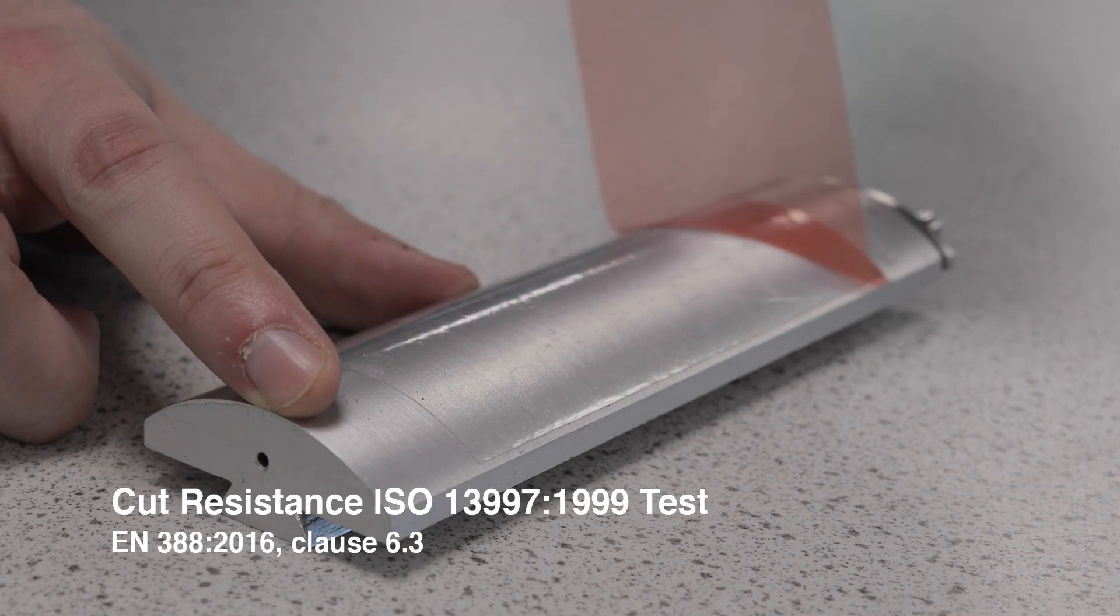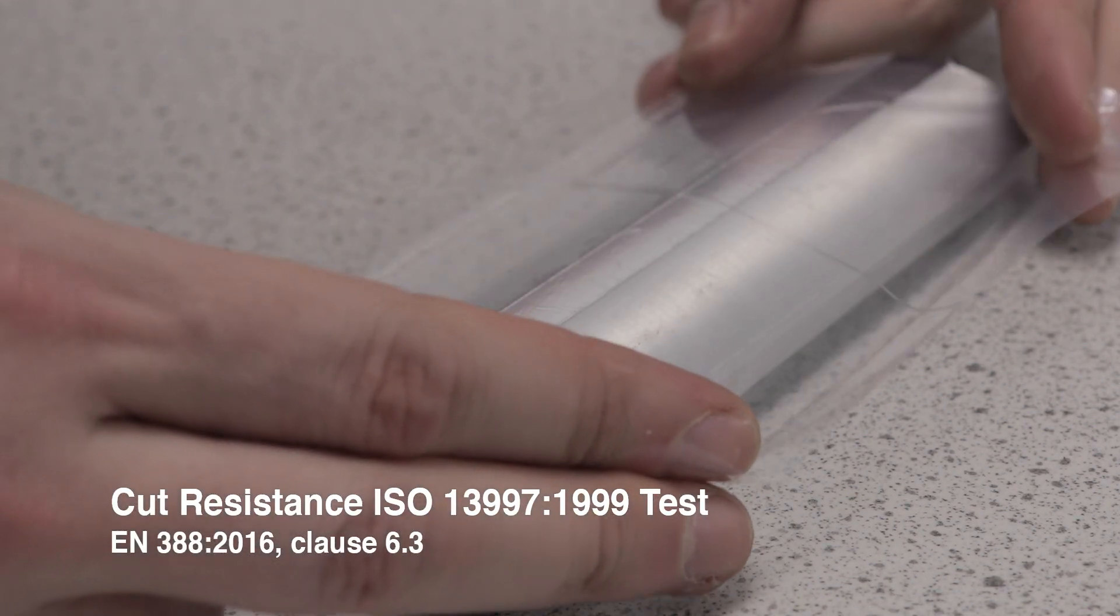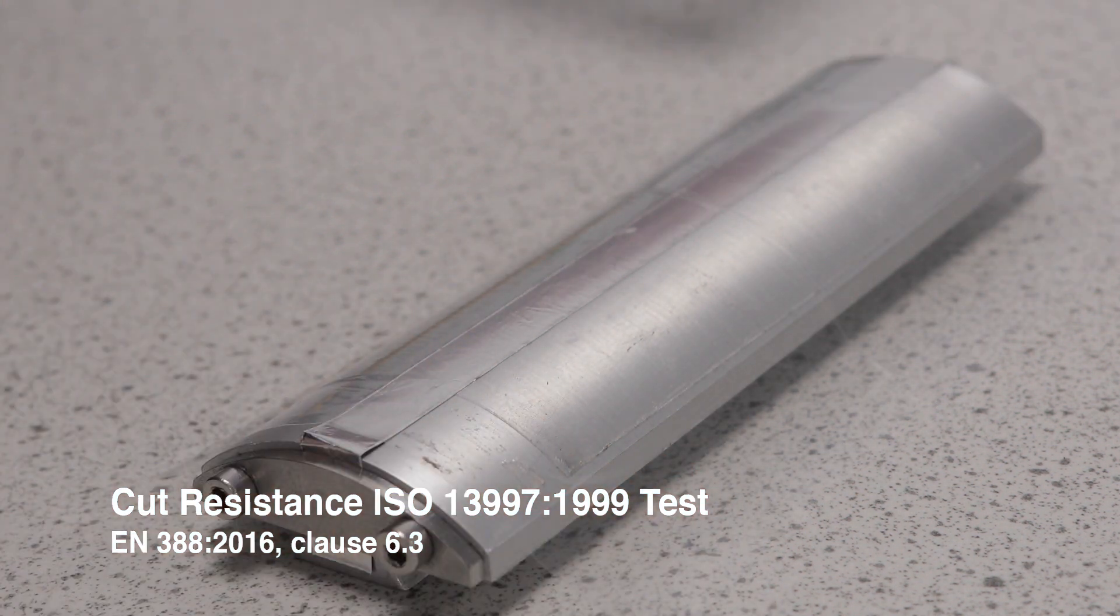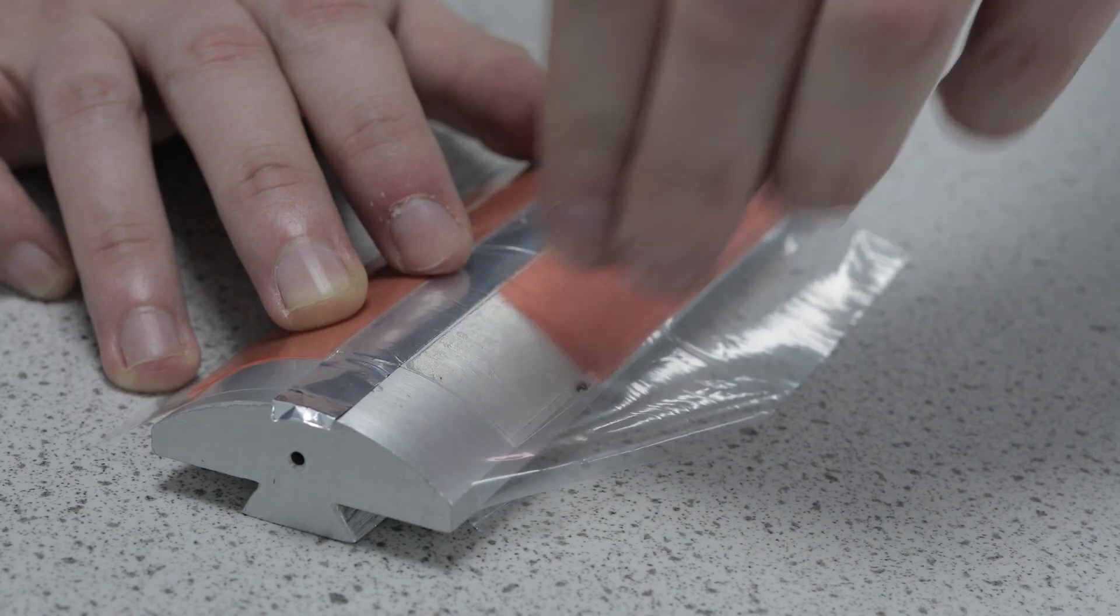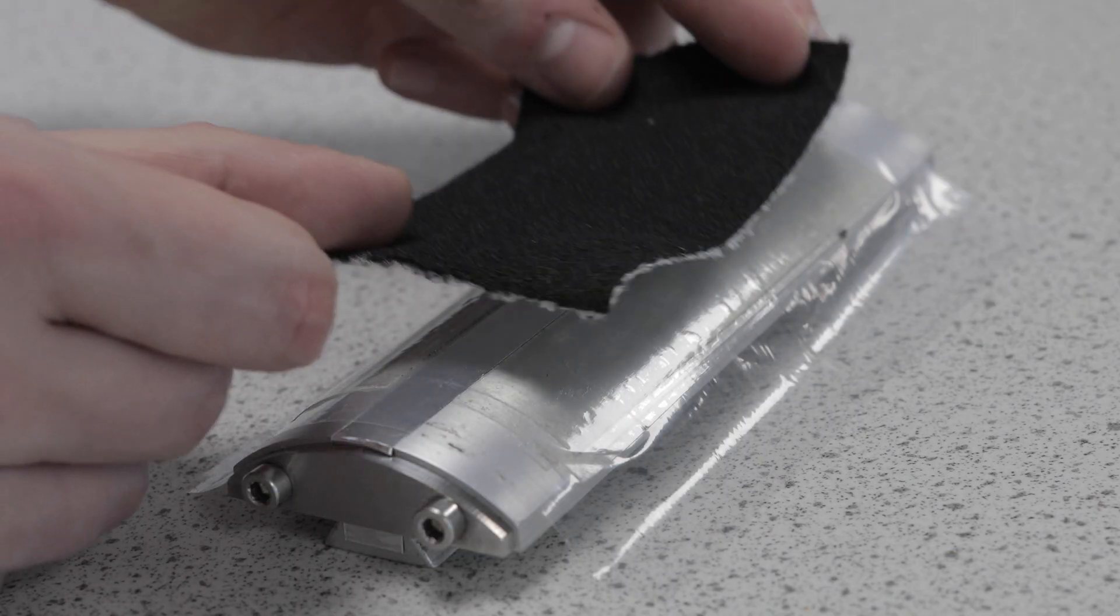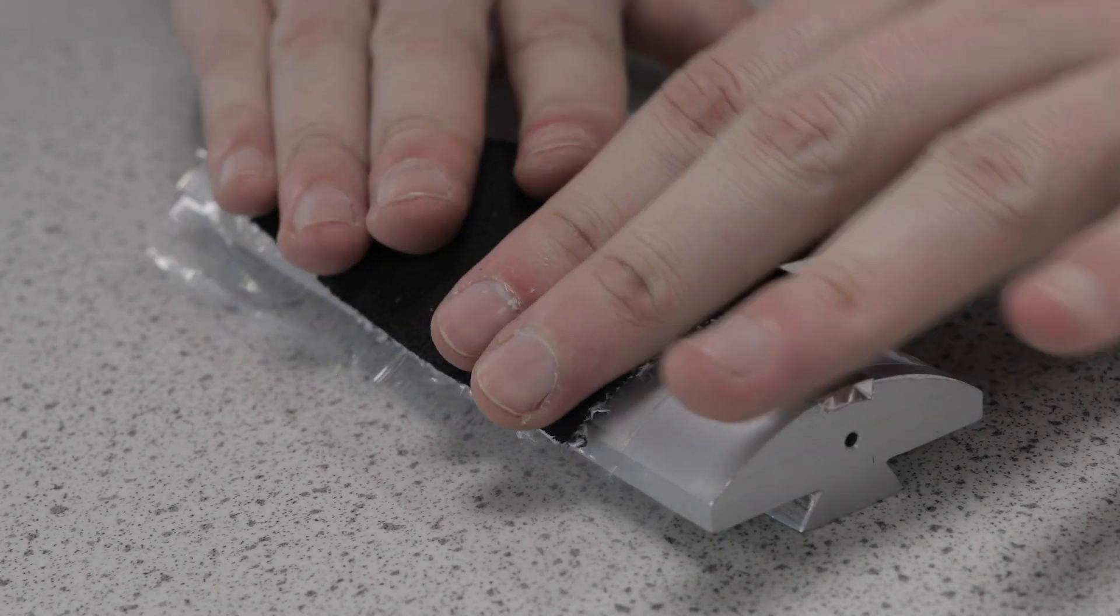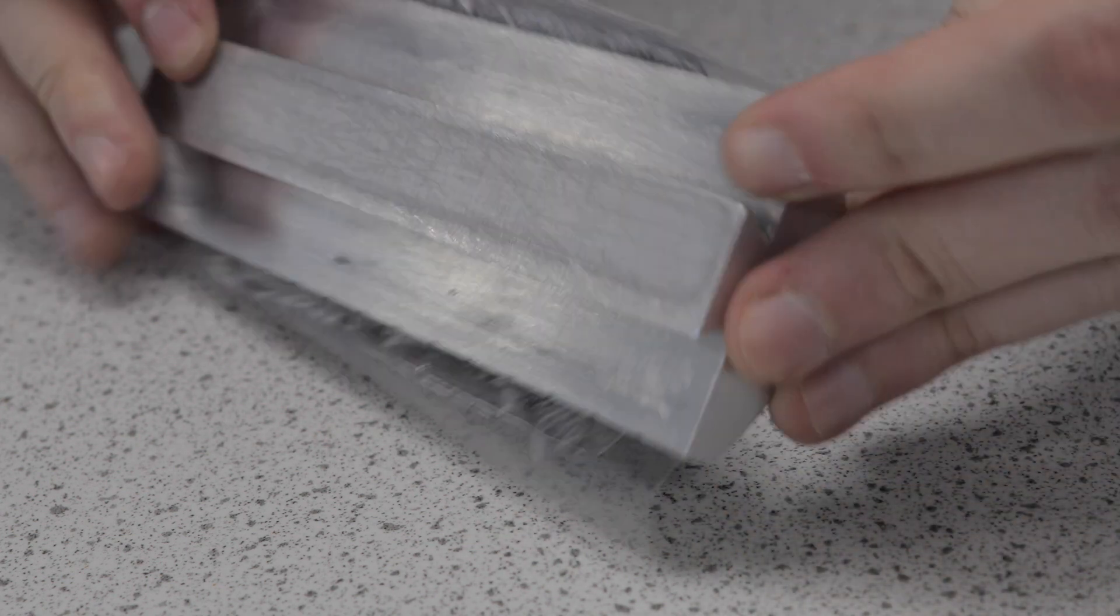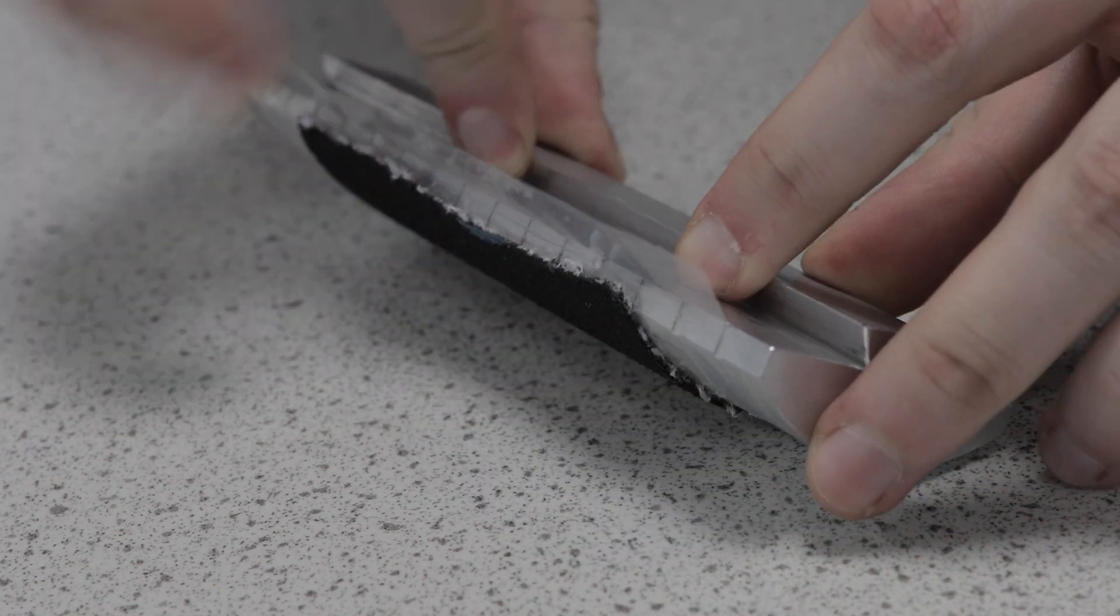The ISO 13997 cut resistance test more effectively assesses the level of cut resistance high cut protection gloves offer. The test sample is mounted on a mandrel. Like for the coupe test, the aluminum foil enables the machine to detect the moment of cut through by the blade.